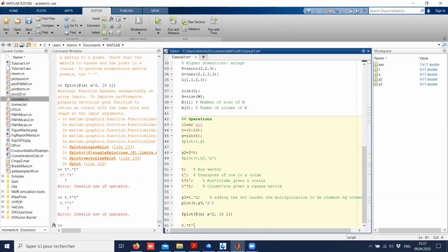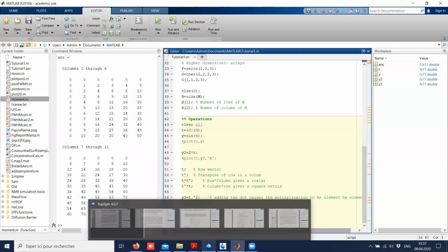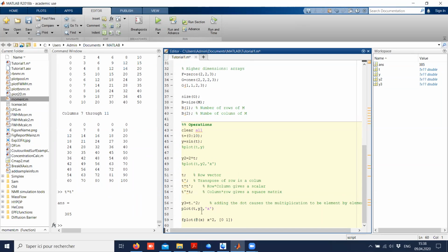Of course, this was wrong. Oh no, so this is not what I expected. I wanted to show you an example and it turns out to be wrong. So Matlab interprets this as the same thing as this. I must tell you, I'm a bit confused with what is happening here. But this is a bit of a pathologic way to write the operation. So let's stick with this.